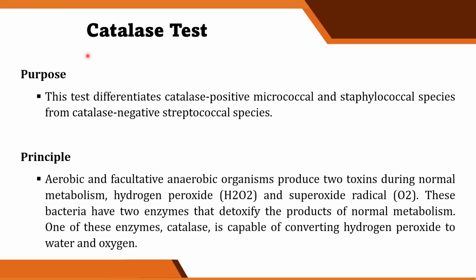Okay? So, how do bacteria protect themselves? They have what you call the catalase. Okay? So, catalase is an enzyme na present sa mga bacteria to counteract the hydrogen peroxide and superoxide radical. So, ang ginagawa ni catalase, kino-convert niya si hydrogen peroxide to water and oxygen. Okay. Now, if walang catalase enzyme, yung bacteria, hindi niya kayang mabuhay in the presence of oxygen. Okay? So, yun yung mga strictly anaerobic organisms.